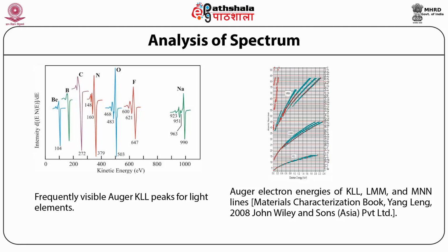This difference is ignored during analysis for elemental identification.